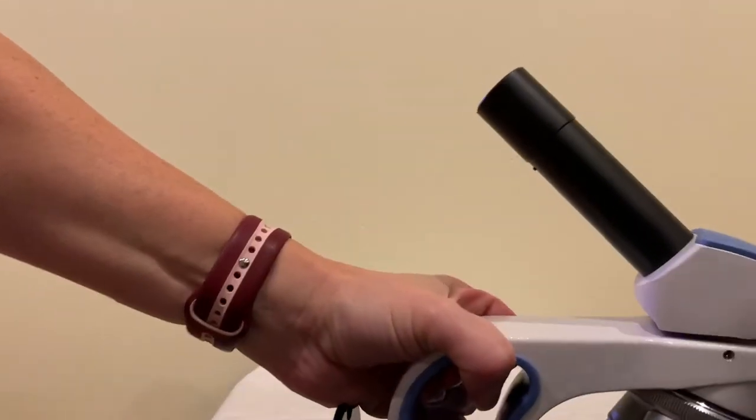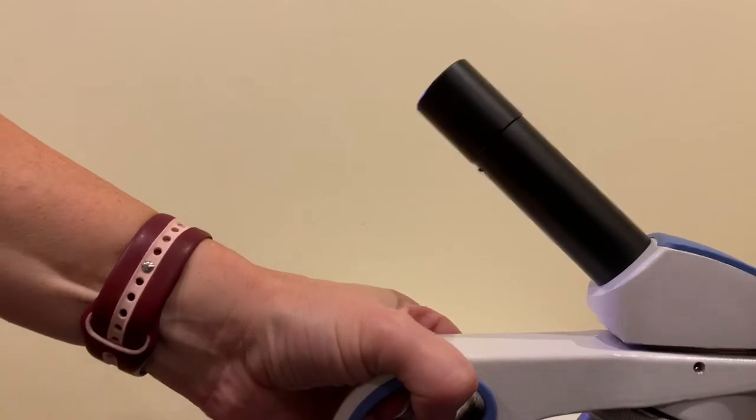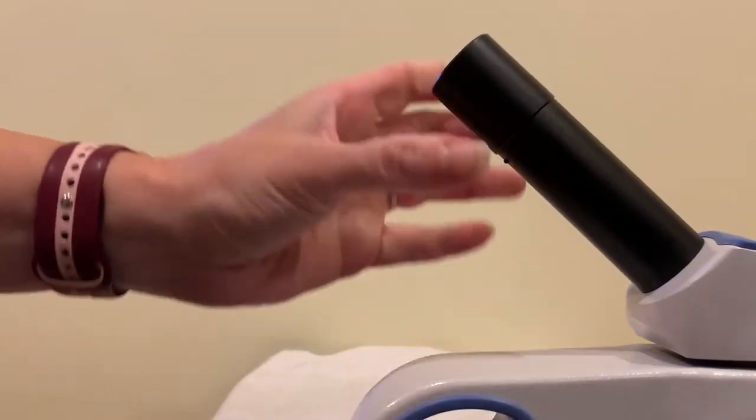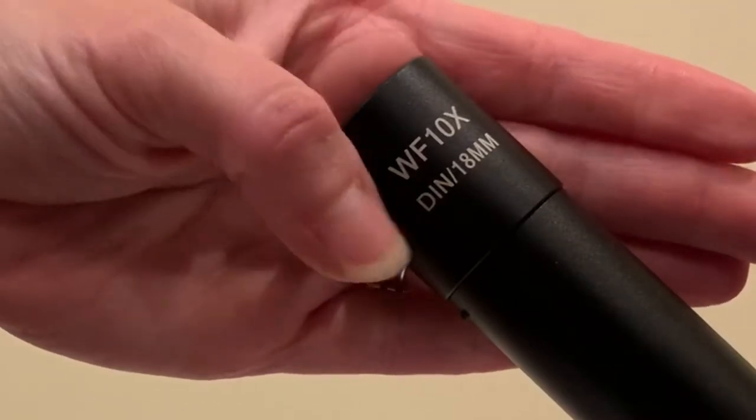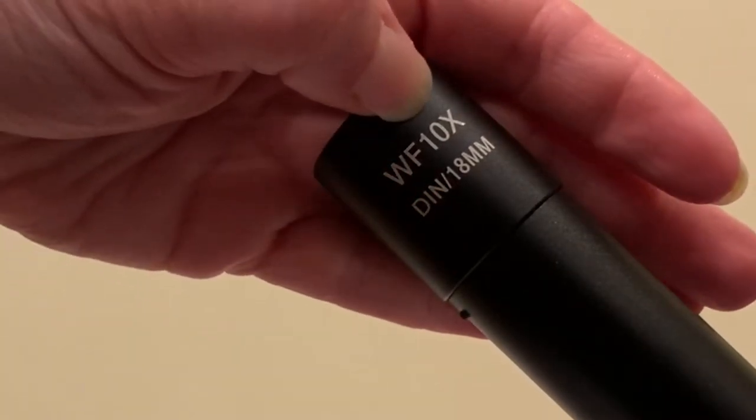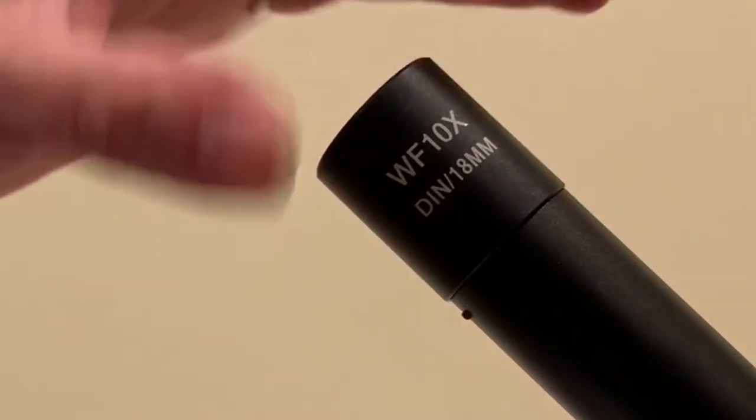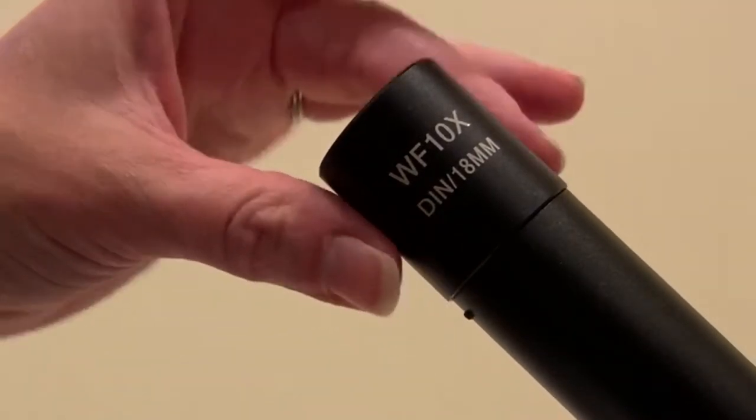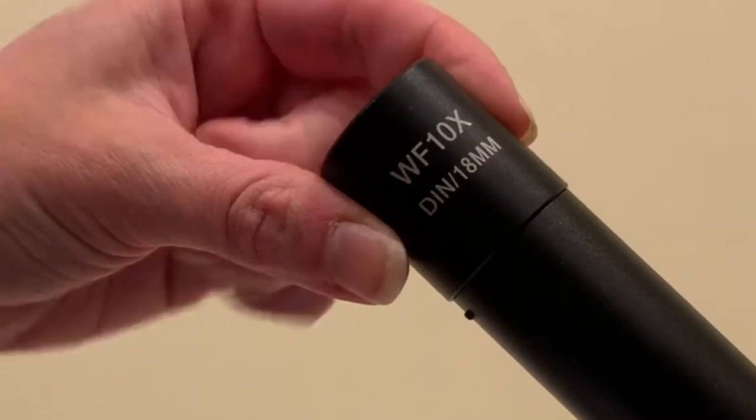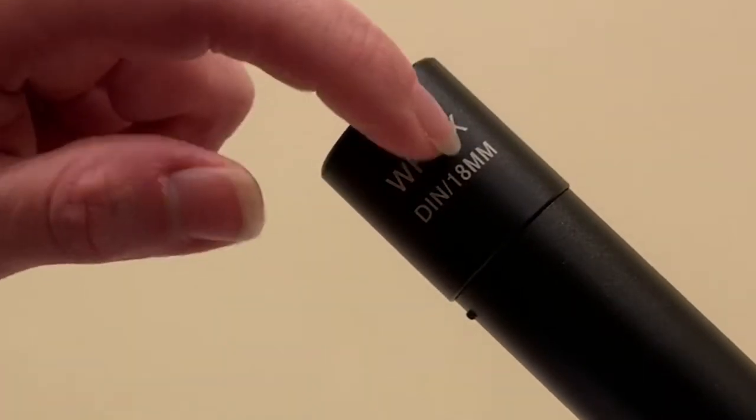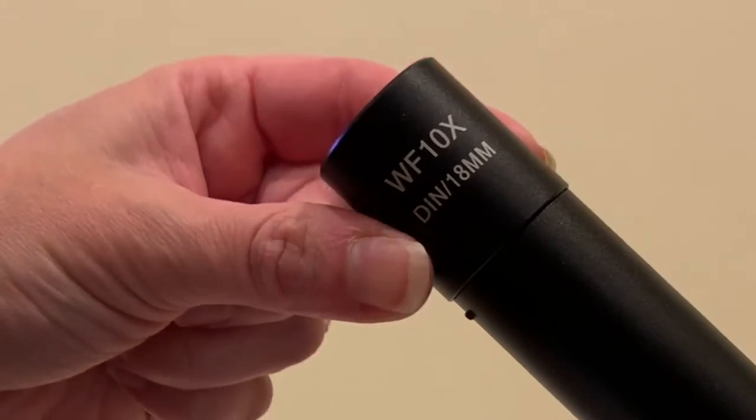Now if we look closely at the ocular lens here you will see that it says 10x. That means that this lens right here magnifies objects 10 times their normal size.